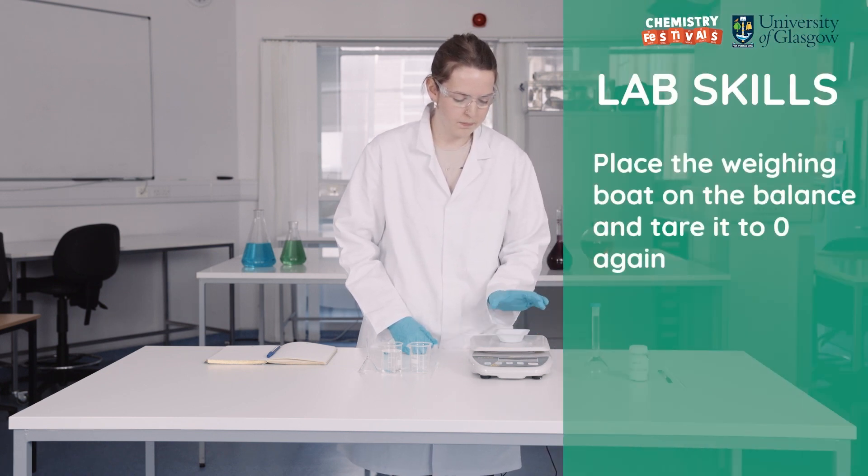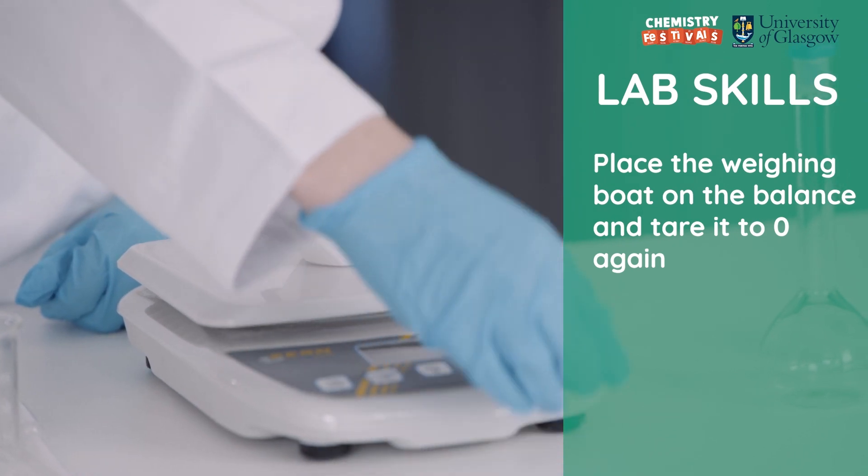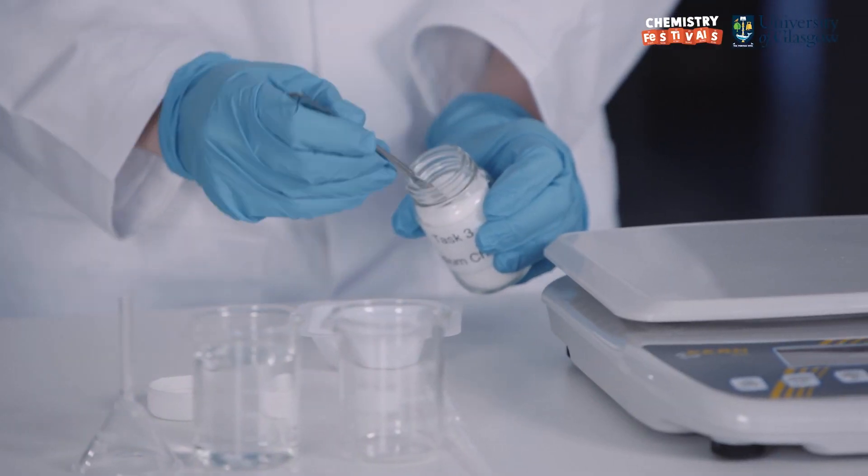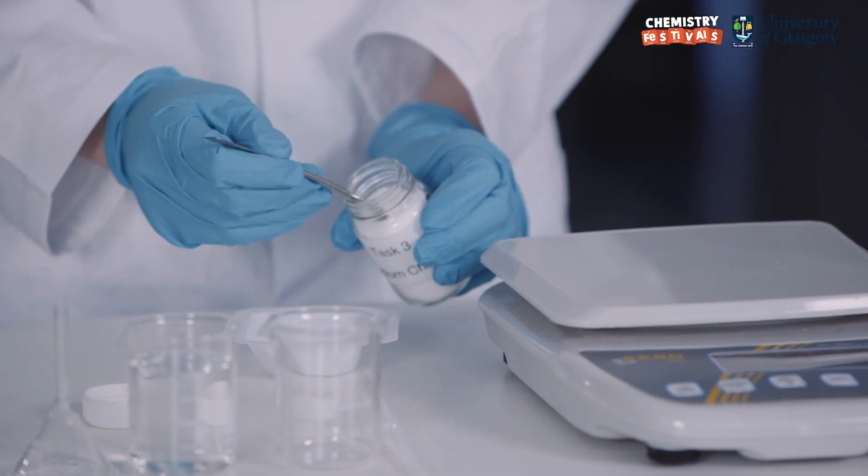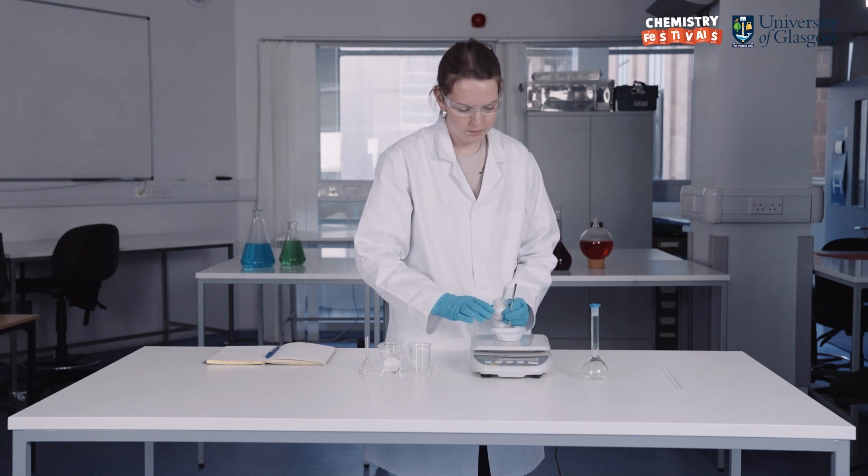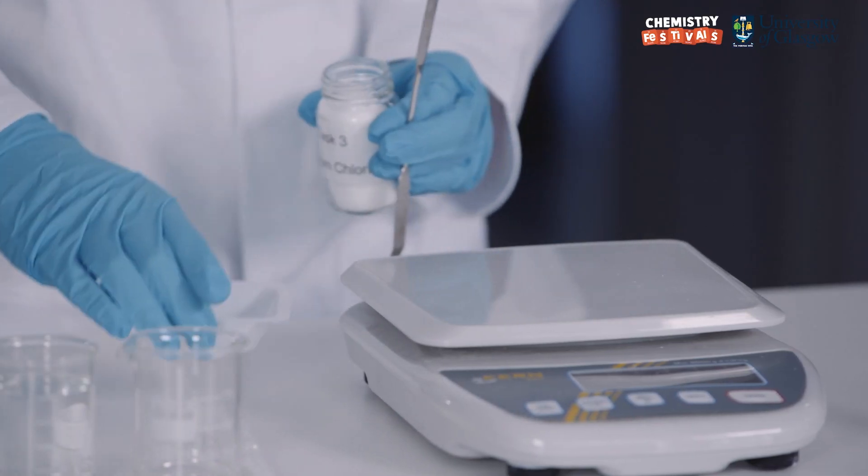I put the weighing boat on the balance and tare it again. I remove the weighing boat and add the sodium chloride. Taking the boat off the balance ensures there is no spillage of the chemical onto the balance. I put the weighing boat back on the balance to check I've got the right mass, and if not I can adjust it accordingly.